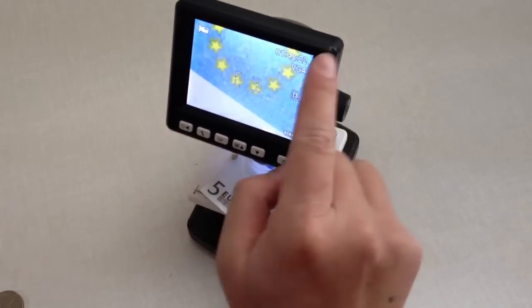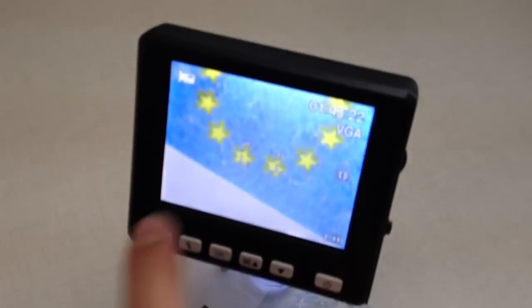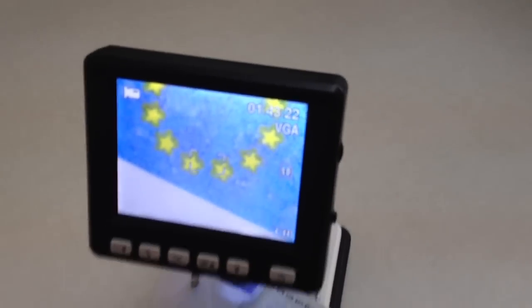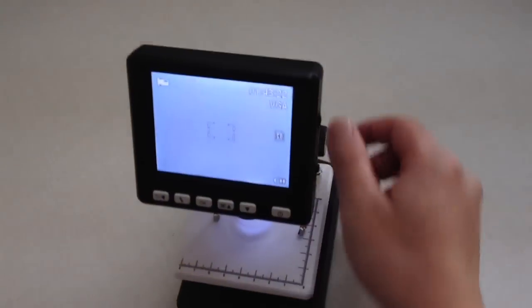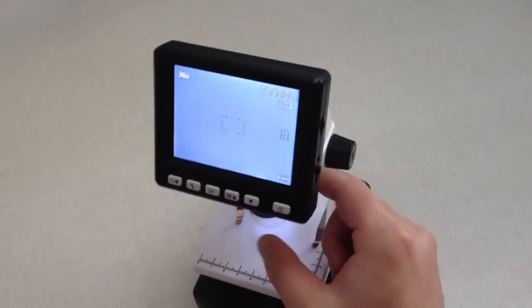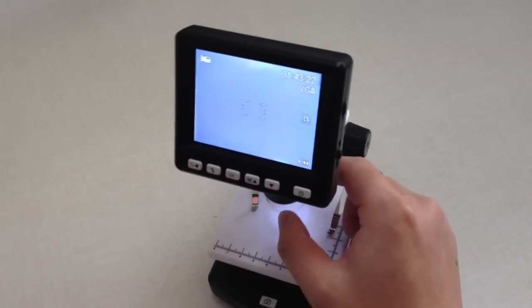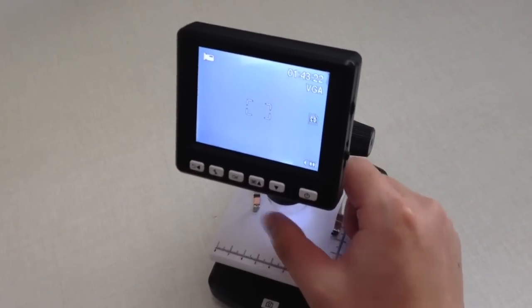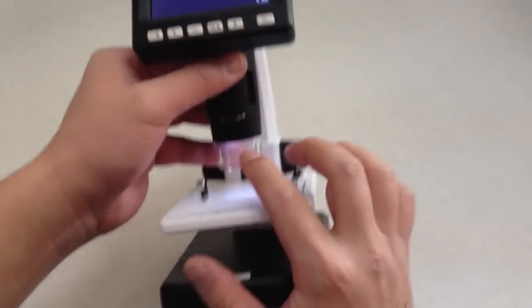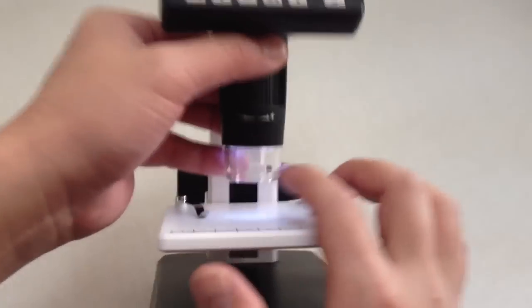This is a 3.5 inch TFT screen with high resolution and a real 5 megapixel camera sensor.